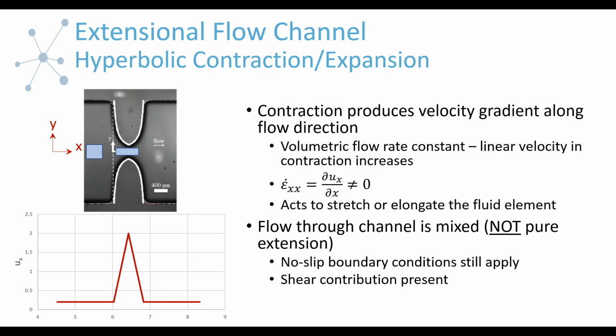So I don't see that there's any disturbance between pressures 1 and 2 due to the hyperbolic contraction. It's very clear when we have secondary flows that there's a disturbance there, but I don't think a flow in the laminar state has any disturbance because of this early extension.